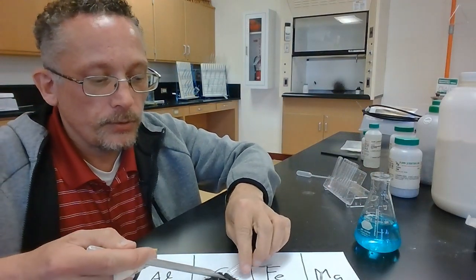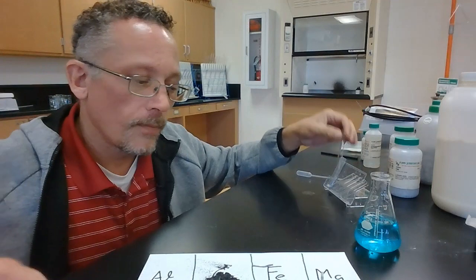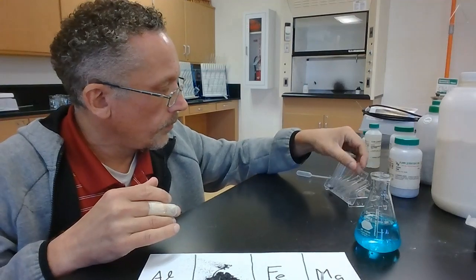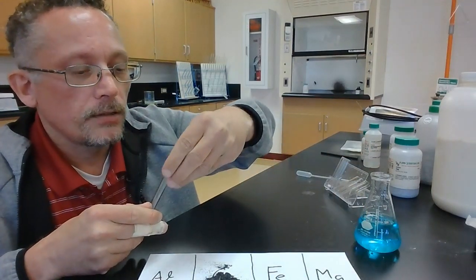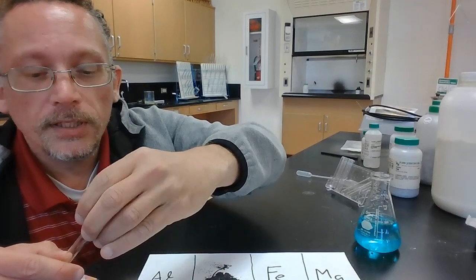So there was the aluminum, there's some carbon, there's a piece of iron in here, there's a bit of magnesium ribbon there, a piece of silicon in there.